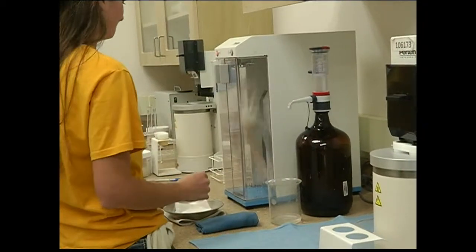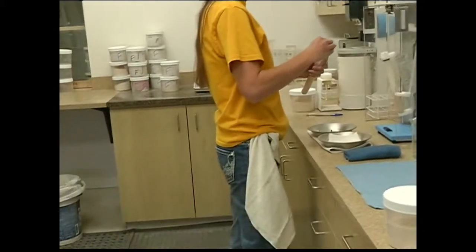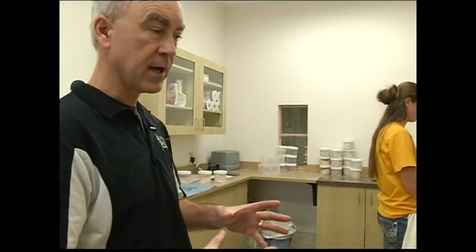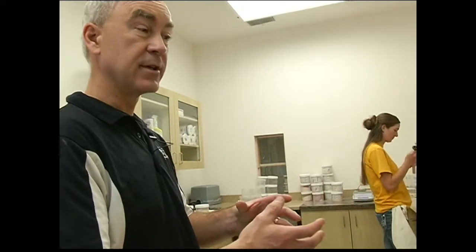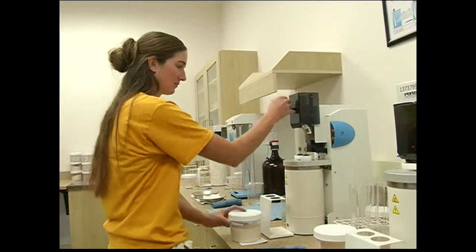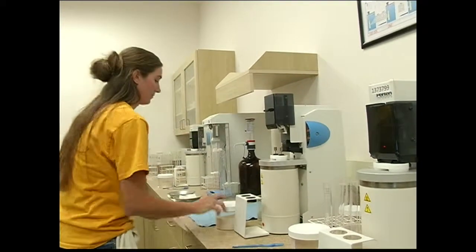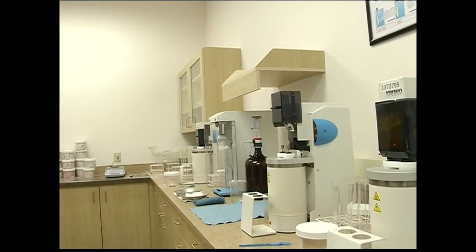So really why we do this test is that during the sprouting process, you can think of it as a 3-step process. The first step is where that kernel is absorbing moisture from rainfall. The second step is where the kernel is releasing the enzyme into the kernel to convert the starch into sugar. And the third step is where the sprout is actually coming out. So as an inspector, you're looking at the third step of the process, where the falling number test is looking at the second step of the process. So this is designed to detect the damage earlier than what the inspector can test.